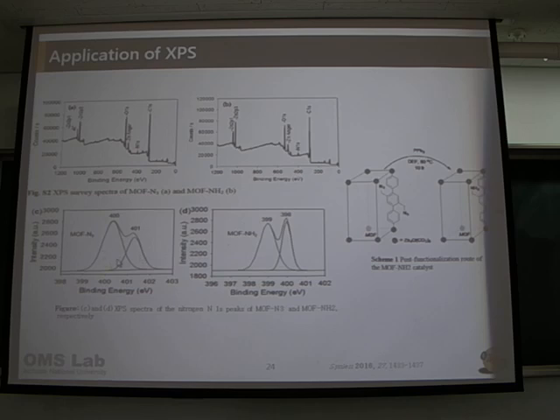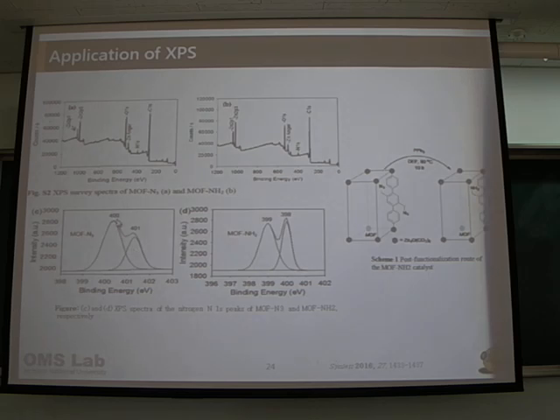And the figure below shows the azide-containing compound, for the nitrogen N1 peak. There are two types of peak. This is the high resolution peak, in this case the nitrogen. This nitrogen is a very small peak. If we deconvolute this small peak, then it shows two peaks. One is at 400 and another one is at 401.